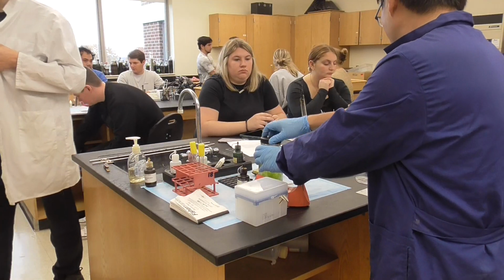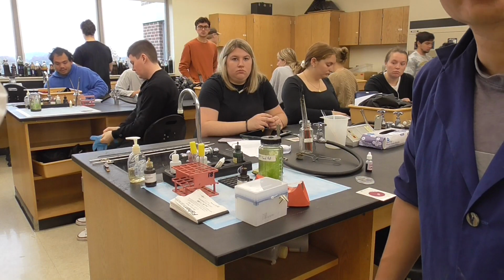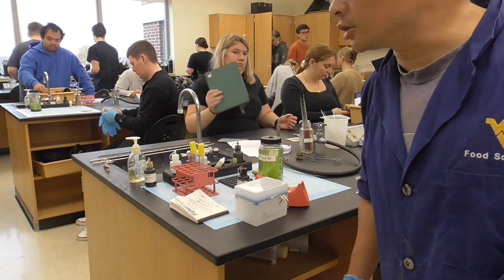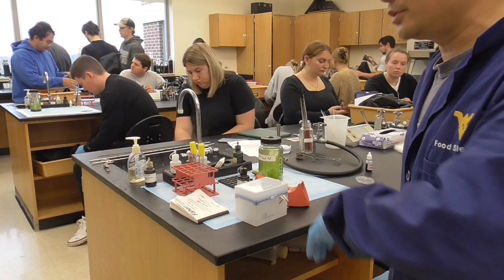Everybody do it as a pair for lactophenol cotton blue because it looks bad. Everybody do it individually for the coliform and generic E. coli for the pond water. So you finish your dilution, you finish your petrifilm, adding the sample onto the petrifilm.